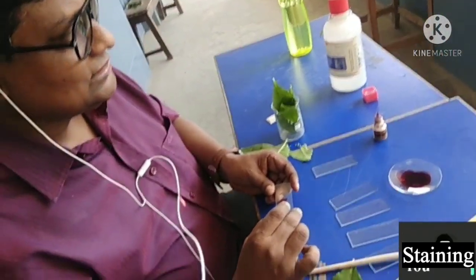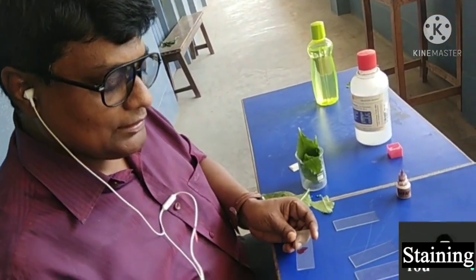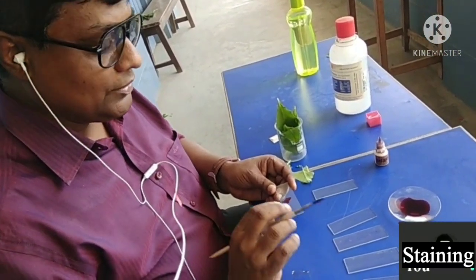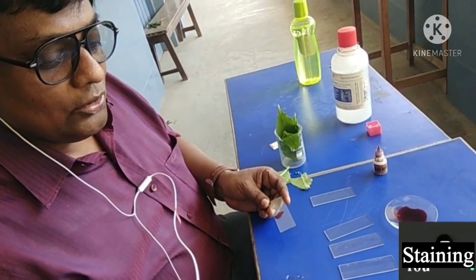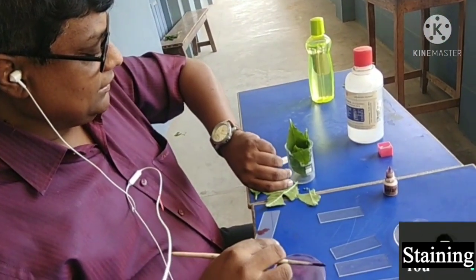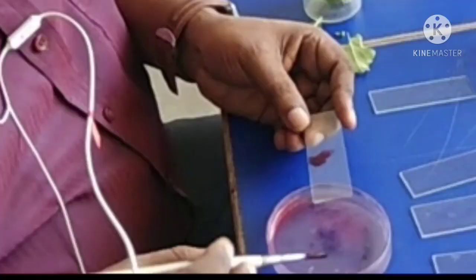One advantage of safranine is that even if there is over-staining, the slide will not be damaged. If you keep it for a very long time it will be over-stained, and under the microscope everything will appear black. Now I think one minute is over, so we have to wash it.